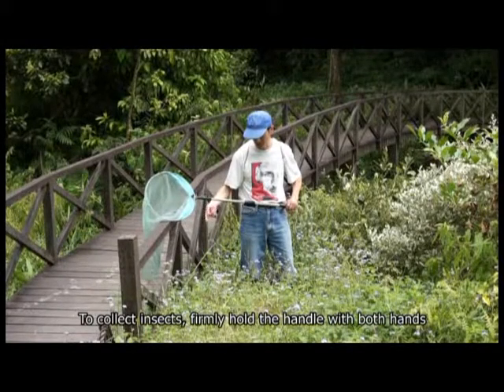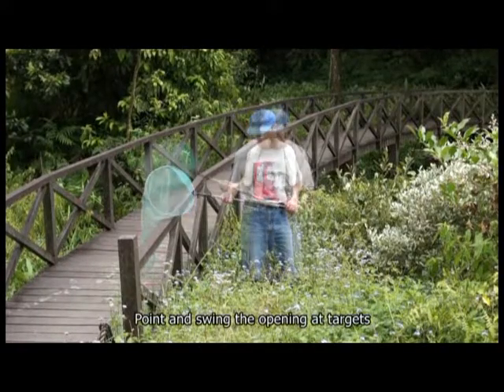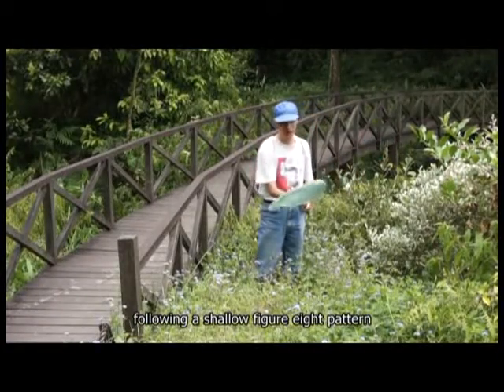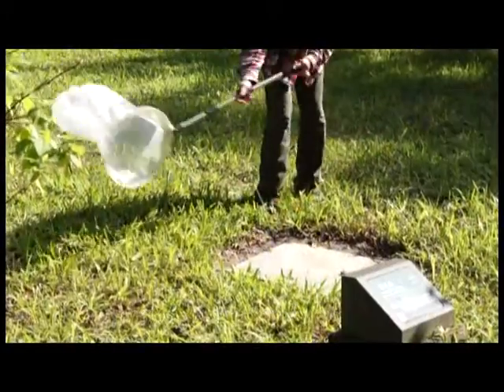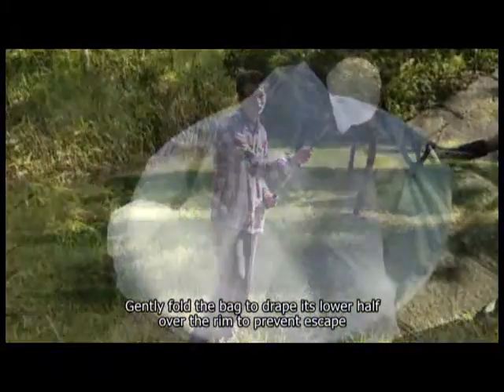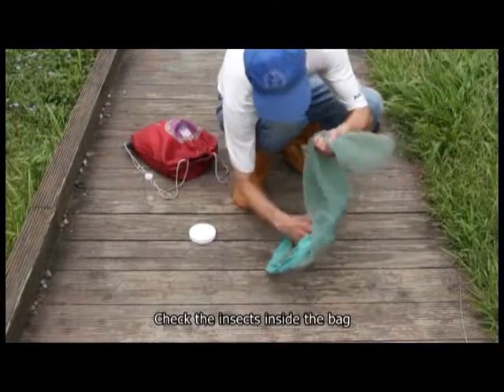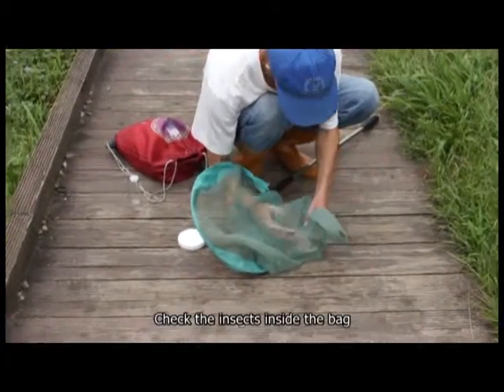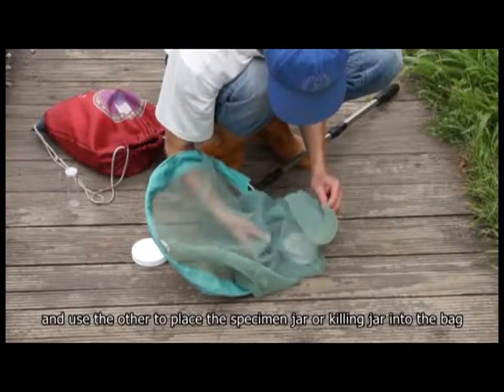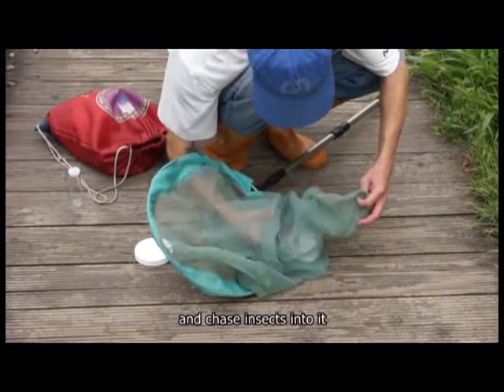To collect insects, firmly hold the handle with both hands. Point and swing the opening at targets following a shallow figure-eight pattern. Gently fold the bag to drape its lower half over the rim to prevent escape. Check the insects inside the bag. Hold the bag with one hand and use the other to place the specimen jar or killing jar into the bag and chase insects into it.